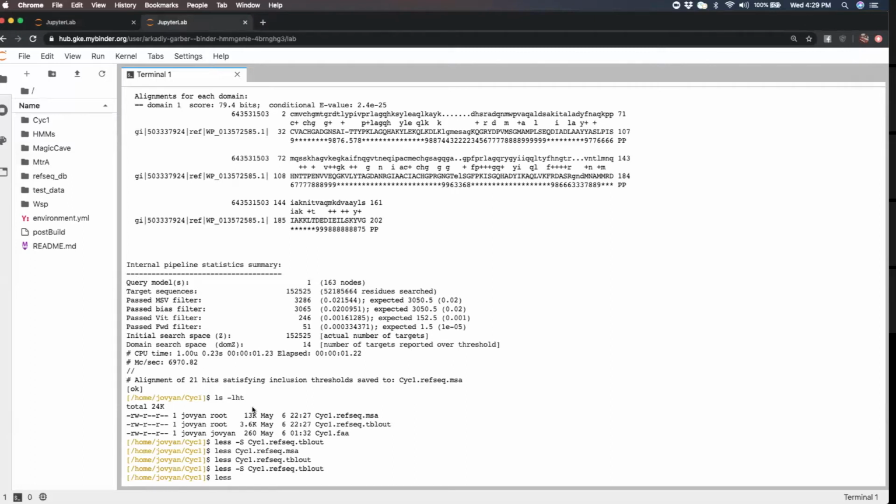So I'm starting to play with a few ideas on how to have a manual alignment checker so that you can speed up this part of the process, because I have hundreds of genes I'm looking for innate immunity, so it's just very slow. I have to look at every single alignment file. I don't know, Arkady, do you have any comments on that?